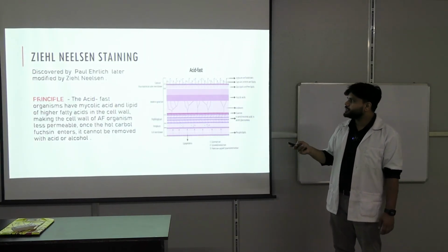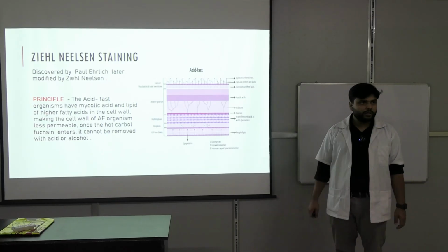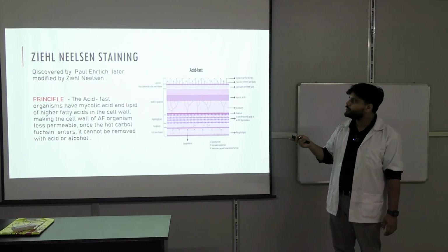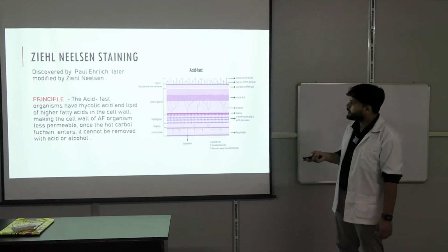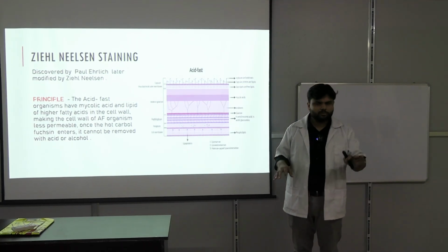So this was actually discovered by Paul Ehrlich and later modified by Ziehl-Neelsen, okay? So see, it doesn't matter who discovers, who modifies is what is named after, okay? So it's named after Ziehl-Neelsen. So the main principle is, I'm going to tell you in a simple way. You don't have to write this, okay?